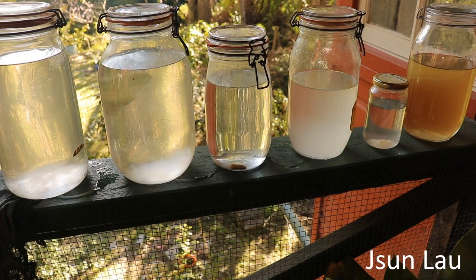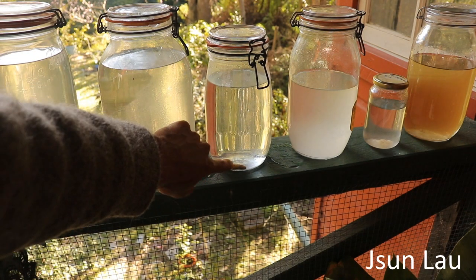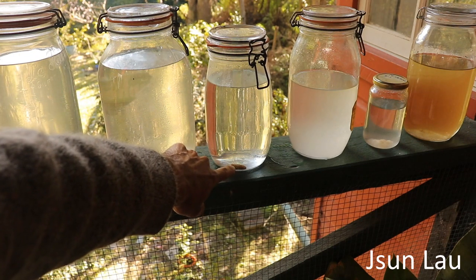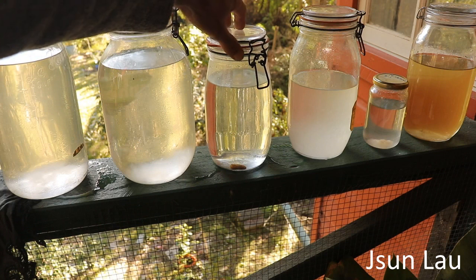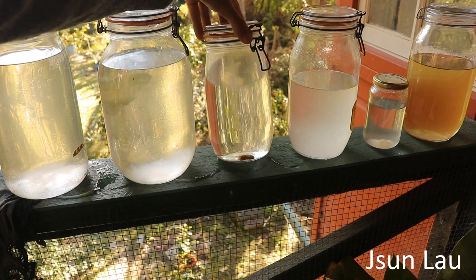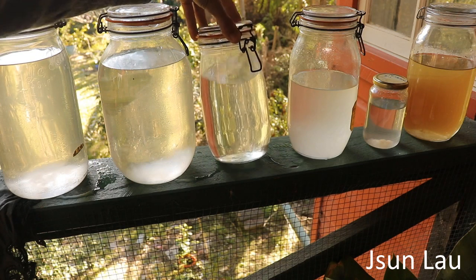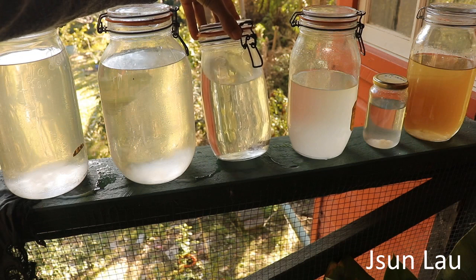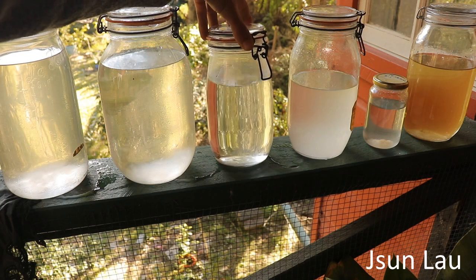These are some of my liquid cultures. This one here — you can see the little piece of morel mushroom in there. It's a new one that's been going for maybe a week, and it's got little floaty bits where the mycelium is starting to grow from the spores.